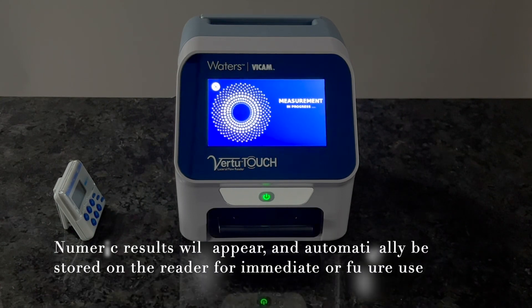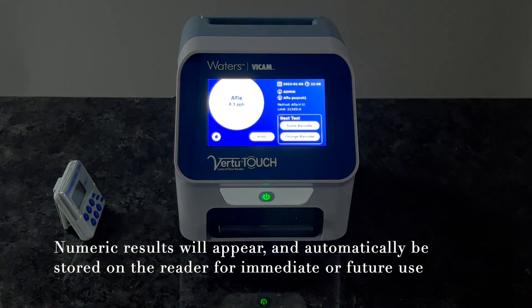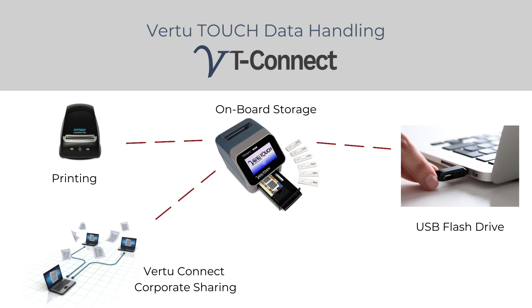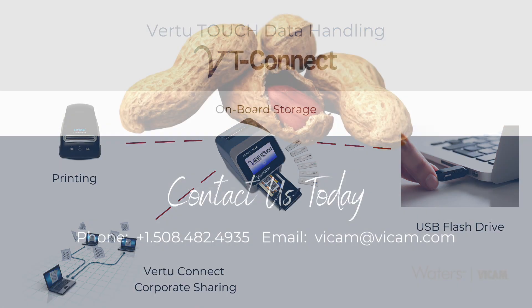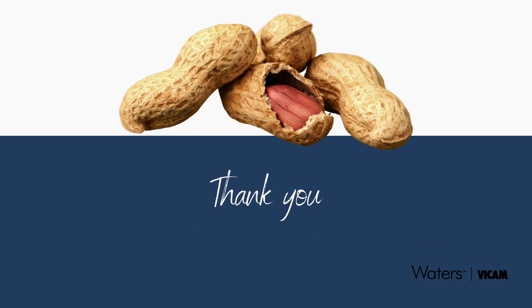Results will appear on the screen. Your results are now ready to use or transfer using onboard storage, USB memory storage, or Vertu Connect software, which enables secure data access and sharing within your operation. To learn more, contact us today. Thank you for spending the time with us learning about Afla-V AQUA for aflatoxin monitoring in peanuts and peanut paste.